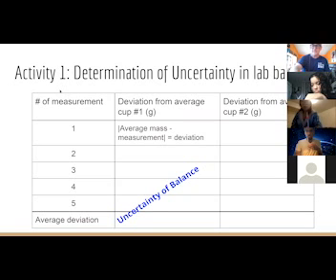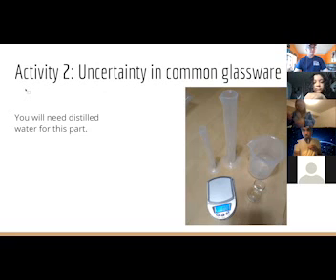I have a question. Is this the top of the thermometer, or am I doing it the wrong way? Yeah, the top has a little loop on it, so you could loop a string through it and then drop it in somewhere. Oh, there we go. Yeah, so this is the top right here. Don't let water splash on your computer. You see that it has that little glass loop on it.